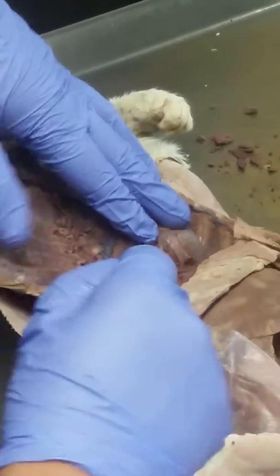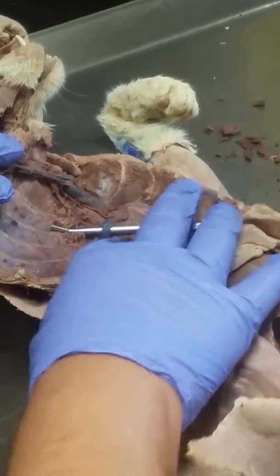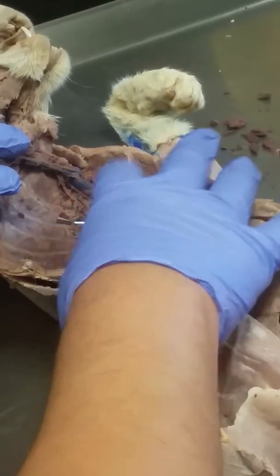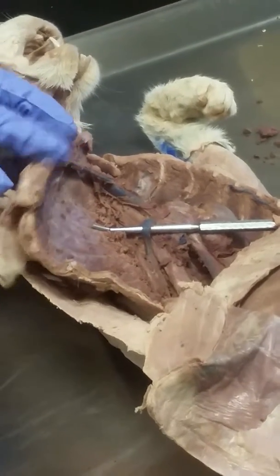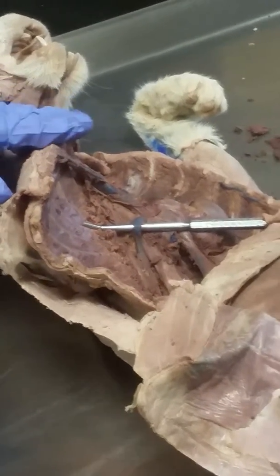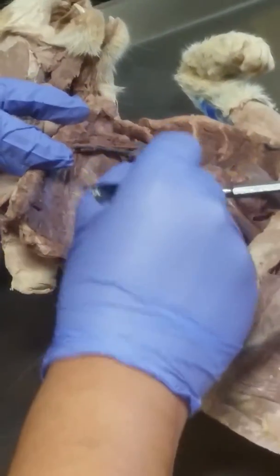This vessel, I snapped it last time, so I won't do it this time. That vessel right there is a vein, and that vein is called the azygous vein, or the azygos, however you want to pronounce it. My professor says azygos. I say azygous just to mess with him.